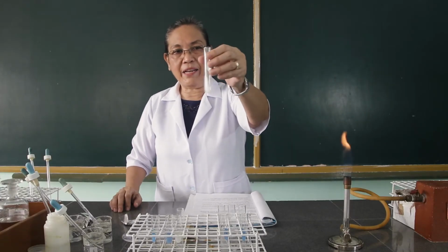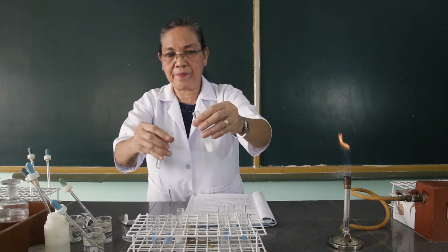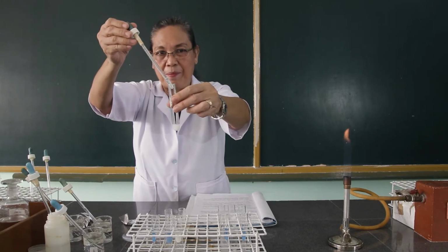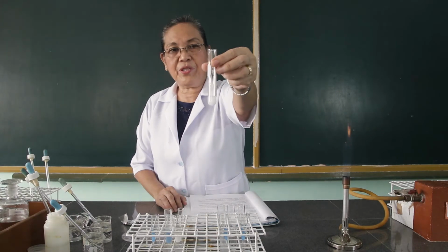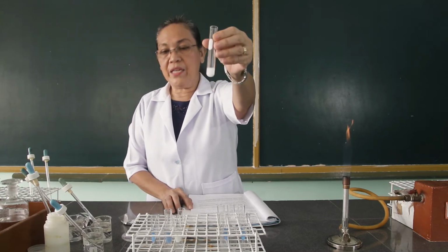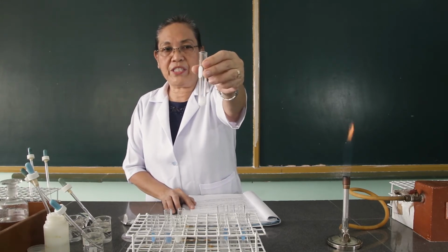Then we're going to get a little amount from this mixture and add it with the diammonium orthophosphate. Kindly observe what happens when the mixture of the saturated ammonium chloride, ammonium hydroxide, strontium chloride, and ammonium carbonate is being added with the diammonium orthophosphate.